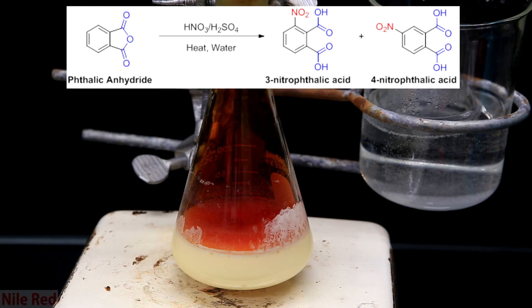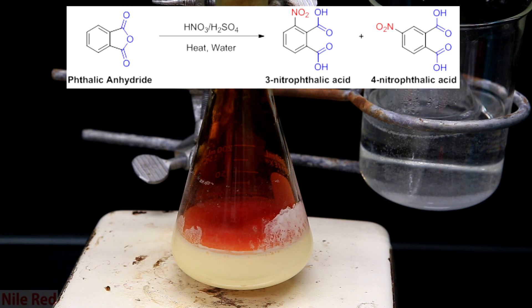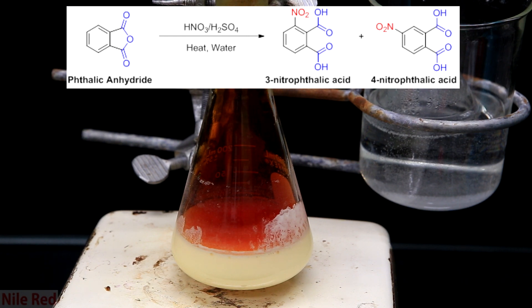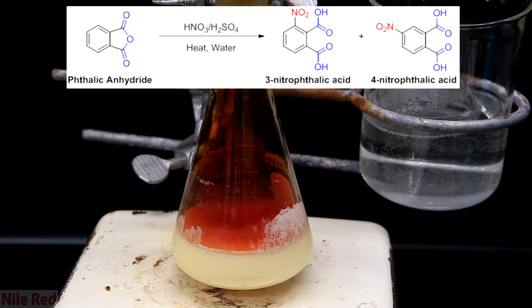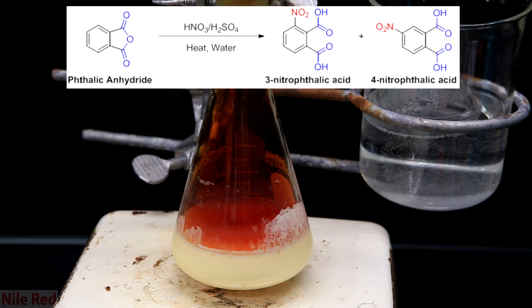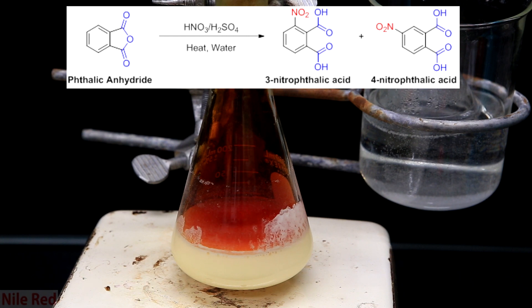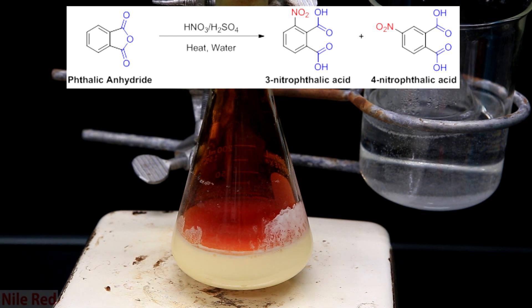The ring that we're putting the nitro group onto is an aromatic ring and the reaction that we're carrying out is known as an electrophilic aromatic substitution. I won't really go over the details of the reaction, but one thing to notice is the part that I highlighted in blue of the phthalic anhydride. The group that I highlighted in blue is known as an anhydride. This anhydride is sensitive to water so on top of the aromatic being nitrated, the anhydride is also hydrolyzed. When the anhydride is hydrolyzed, it forms the carboxylic acids that I've highlighted in blue in the products.